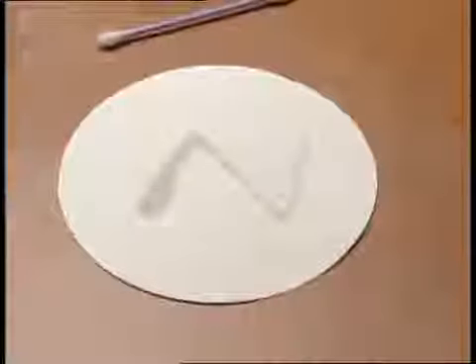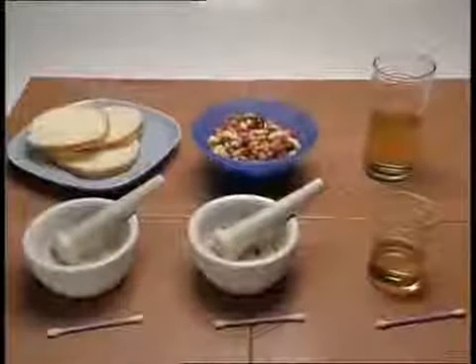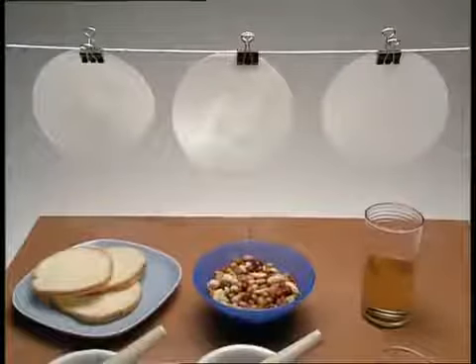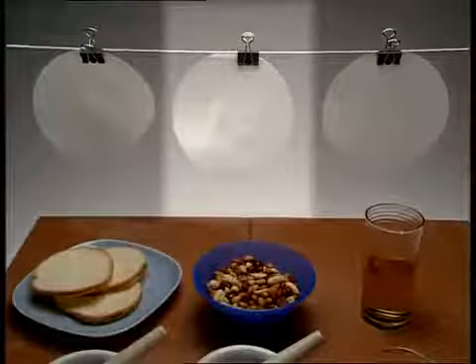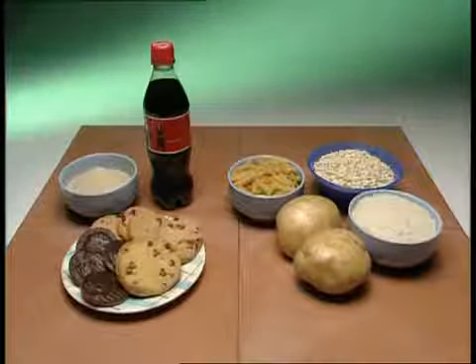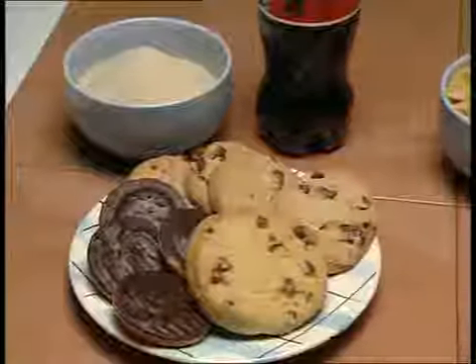They all look translucent to start with because they're wet, so it's important to leave them to dry for a few minutes. Here are the results. Only the nuts contain fat. Next, carbohydrates. Simple carbohydrates are the sugars found in anything sweet.